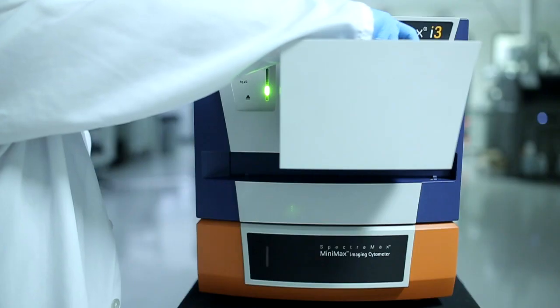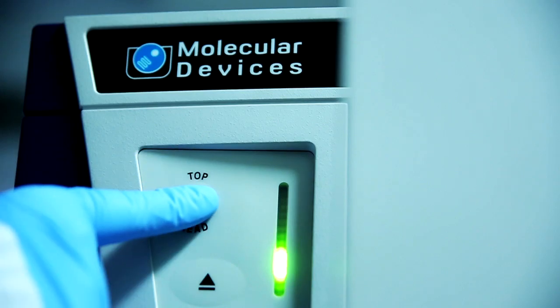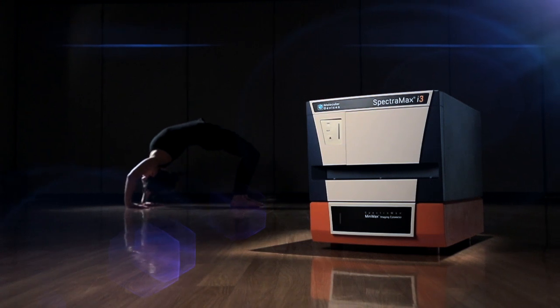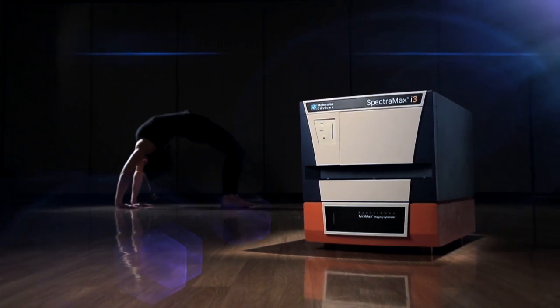Build upon the base system when you are ready by adding user-installable cartridges. There's no need for system downtime or service engineers. Protect your initial investment by having the flexibility to add to your base system.